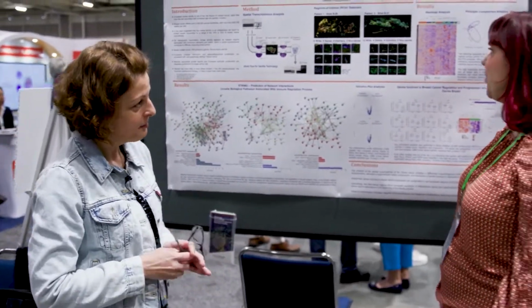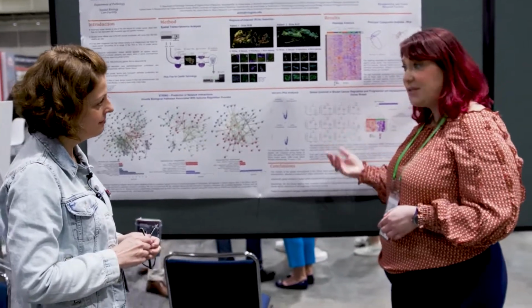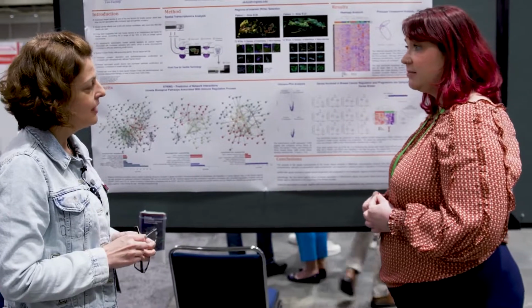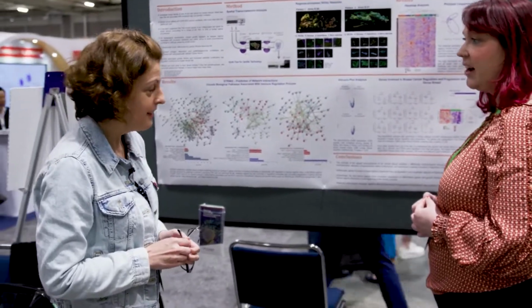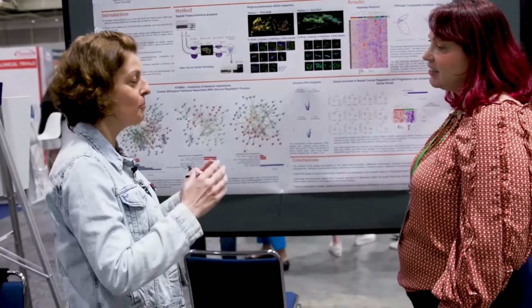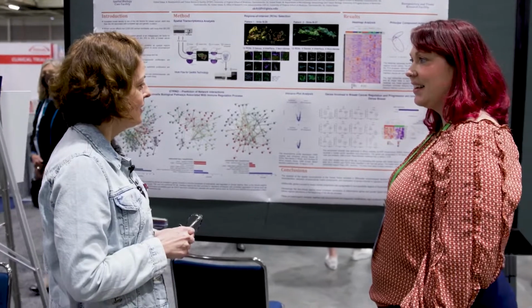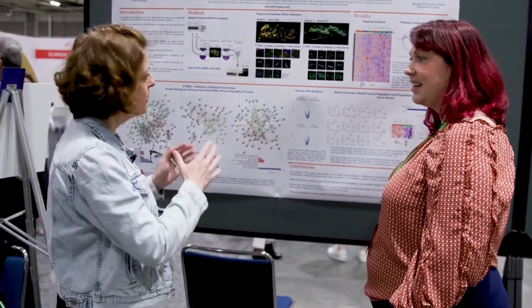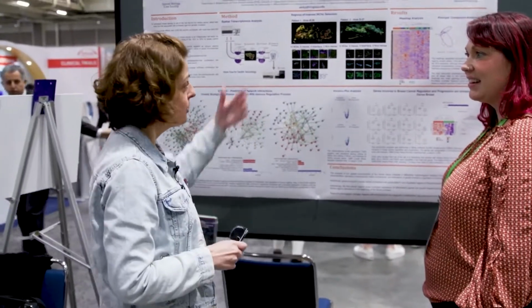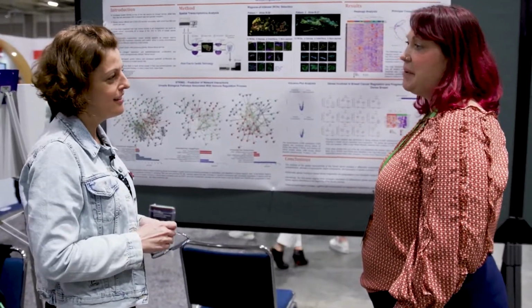Yeah. It's really interesting work. So are you going to do any follow-up studies with the GeoMx DSP? In the future? Yes, I think I want to use the new equipment to validate some targets. And I want to increase donors, more samples, to have a stronger database.